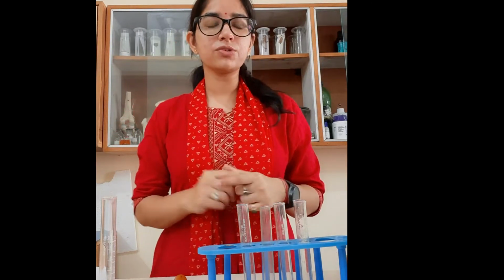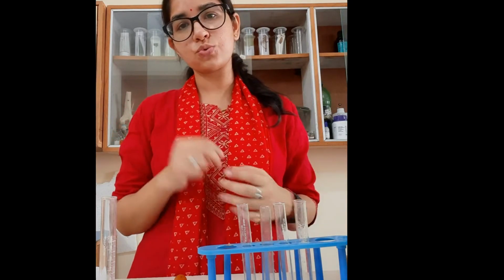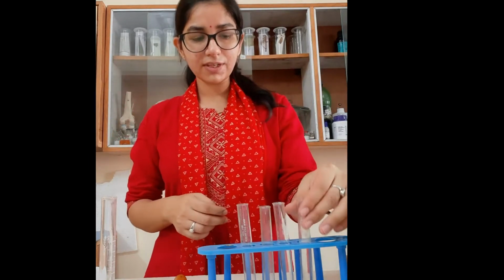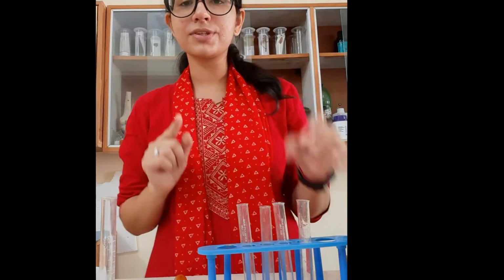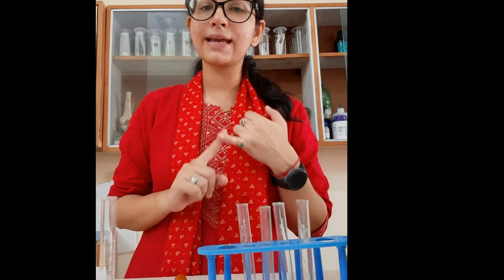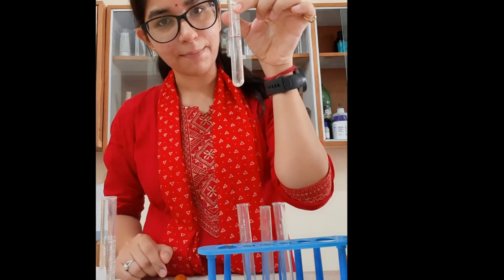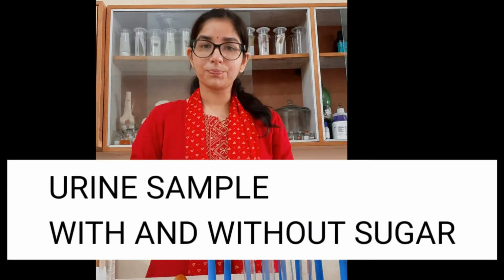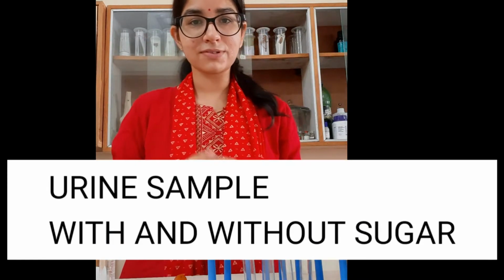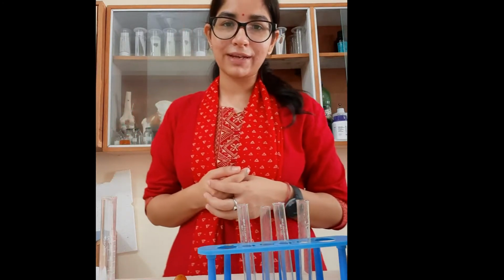So first I'm going to do this experiment in two ways. First, as you can see, what is our aim? To find out the presence of glucose in urine. Today I have taken the urine sample, right? This is the urine sample I have taken, and if the person does not have diabetes, obviously you will not find any glucose.